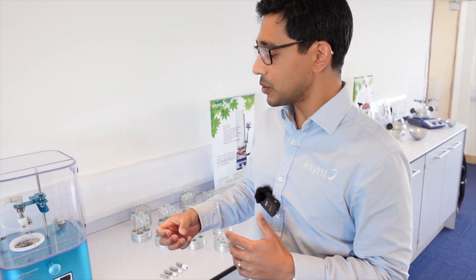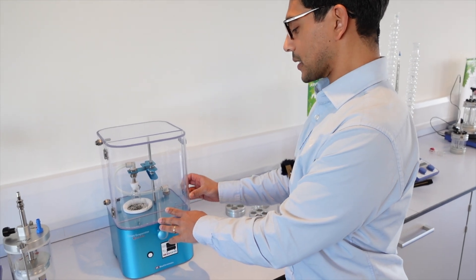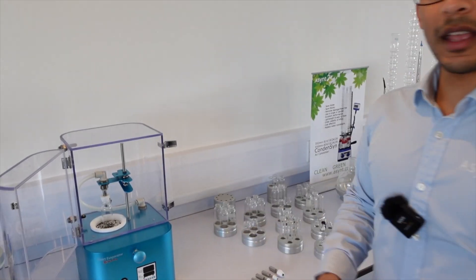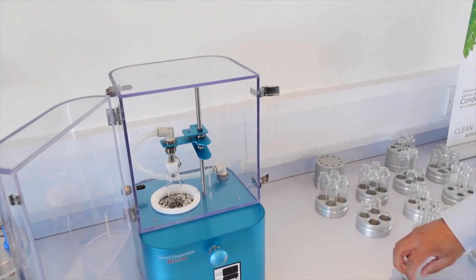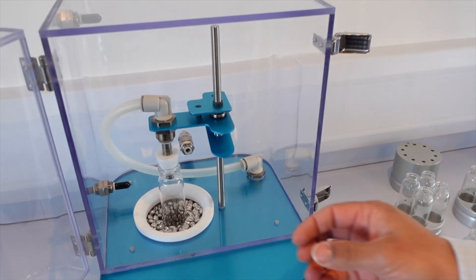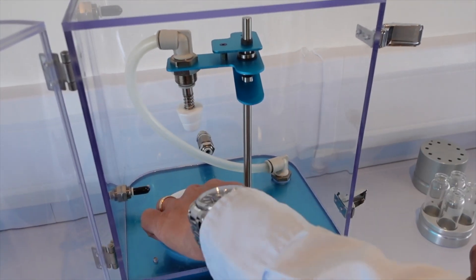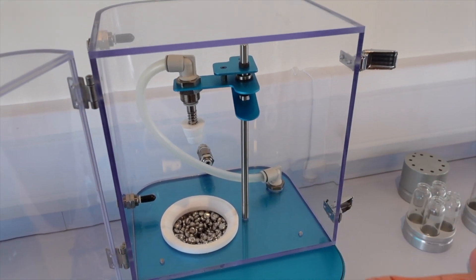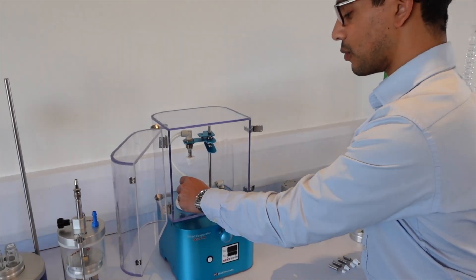If you use lots of different sizes of vials, then the smart evaporator is ideal for you because it's compatible with a number of different vial sizes. As you can see inside the smart evaporator, you can attach different sizes of spiral plug into this metallic bead bath because it will take the shape of any size vial or tube that you wish to use, and any different height also.